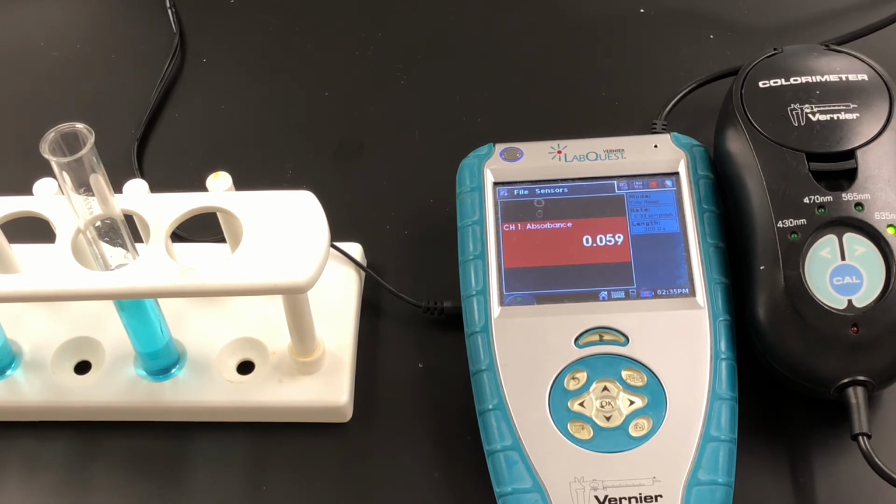So we've got the 8 milliliters. And let's just put 2 water in. Just flush it around. Maybe it didn't mix up too.